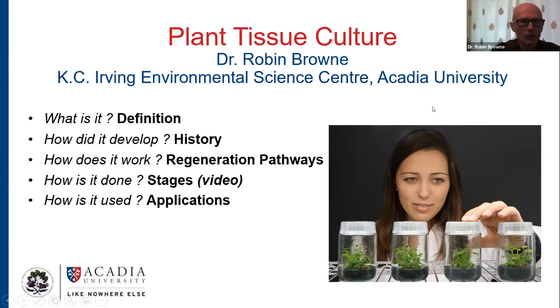I'm here to talk to you today about tissue culture. The purpose of my talk is more in the general sense to describe basic principles and practices of tissue culture. I've got five main topics to cover here: just a basic definition, a brief history, regeneration pathways that are involved in tissue culture, and I want to address the stages of the process.